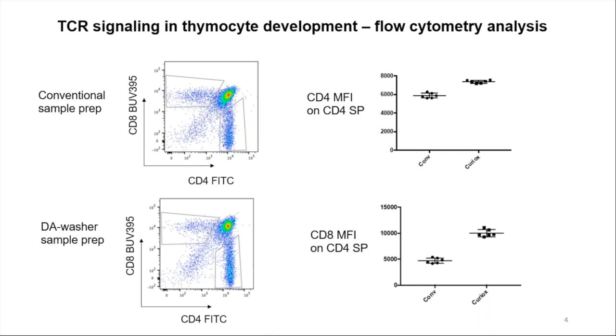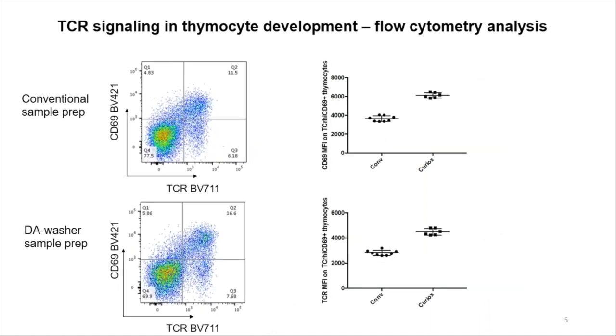And this is going to be even more striking if we look at the very critical cell surface markers, which are normally expressed at much lower levels in thymocytes.